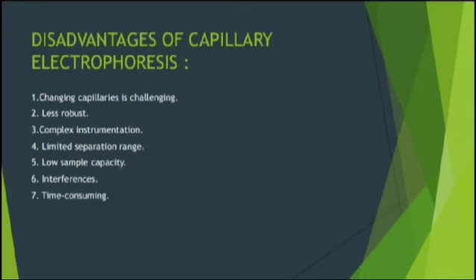Next, disadvantages of capillary electrophoresis: changing capillaries is challenging, less robust, complex instrumentation, limited separation range, low sample capacity, interference, time consuming.